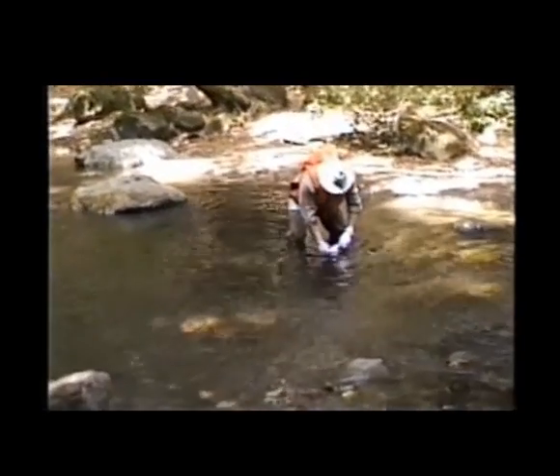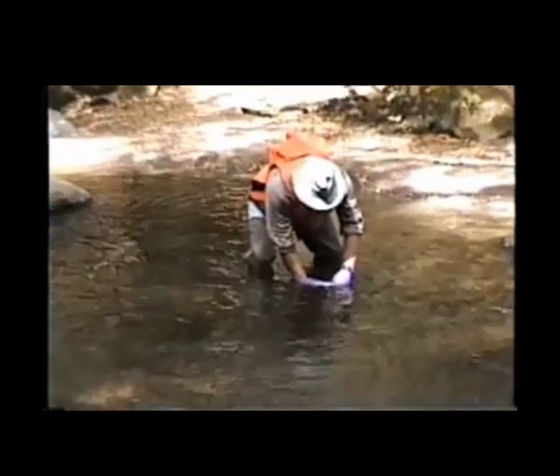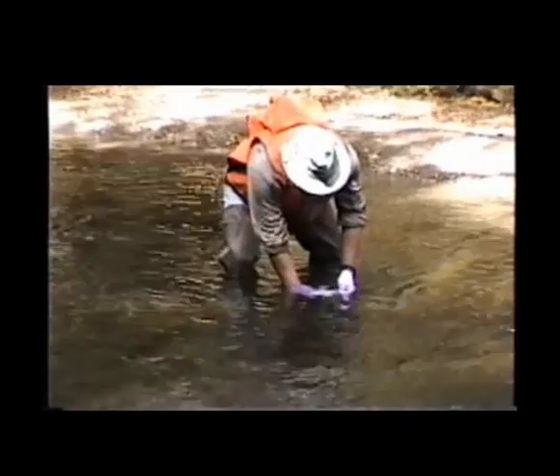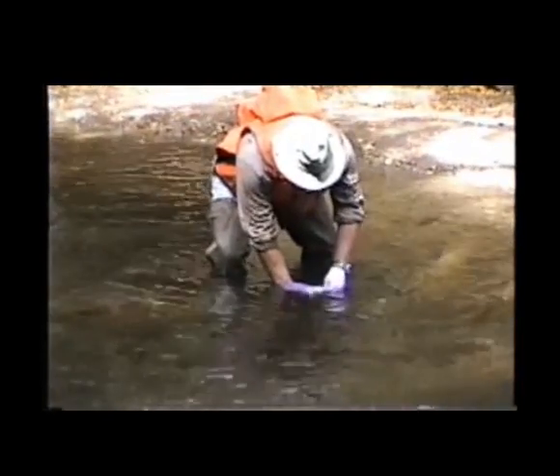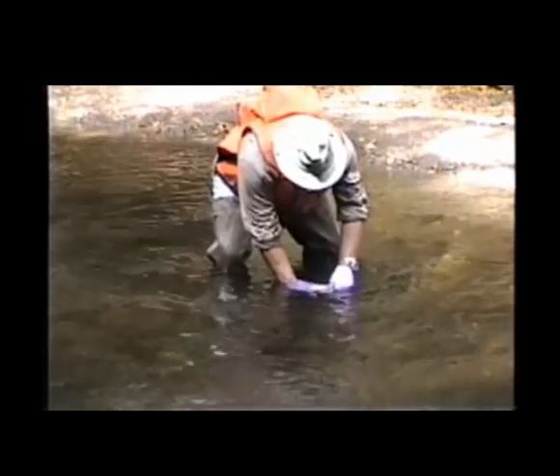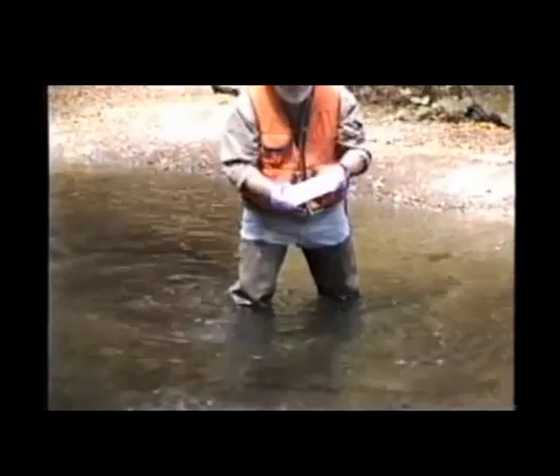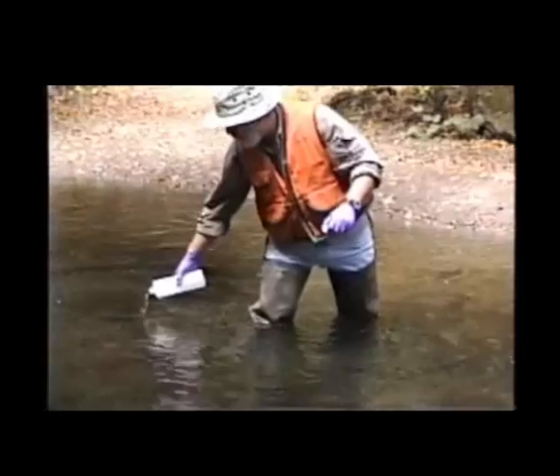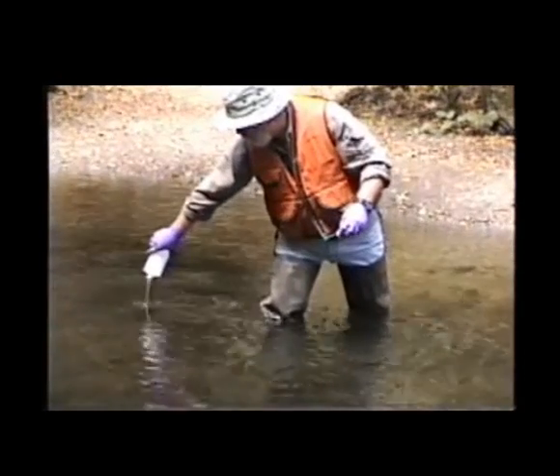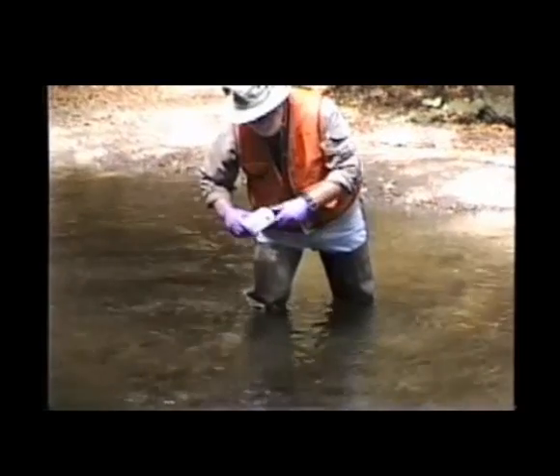Sampler is now taking a grab sample, a subsurface grab sample. He's uncapping the bottle underneath the water, letting the bottle partially fill, then capping the bottle again under the water, taking the bottle out of the water, flushing the ambient water in the bottle, and then he's dumping the excess water downstream. This process is repeated 3 times.